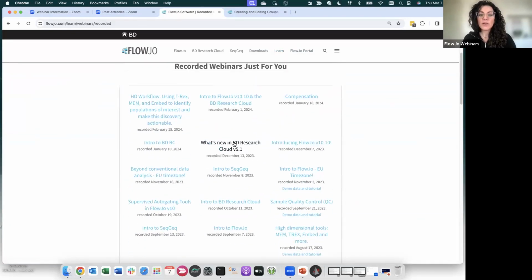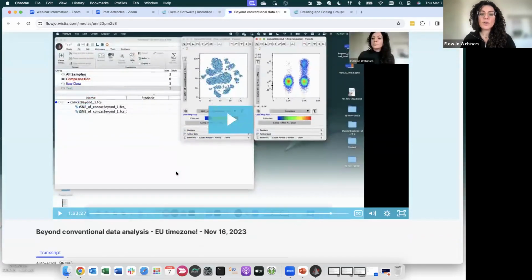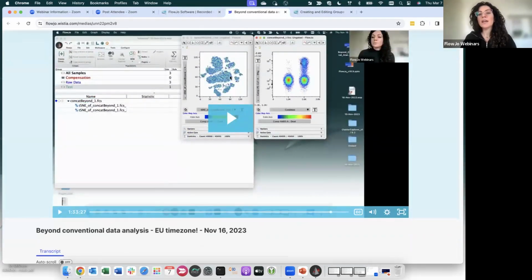So if you go on recorded webinars, you will find this one, beyond conventional data analysis, and this is all about tSNE and clustering and UMAPs and all the advanced features. Unfortunately, I cannot cover this in this webinar right here because it's an intro to FlowJo.